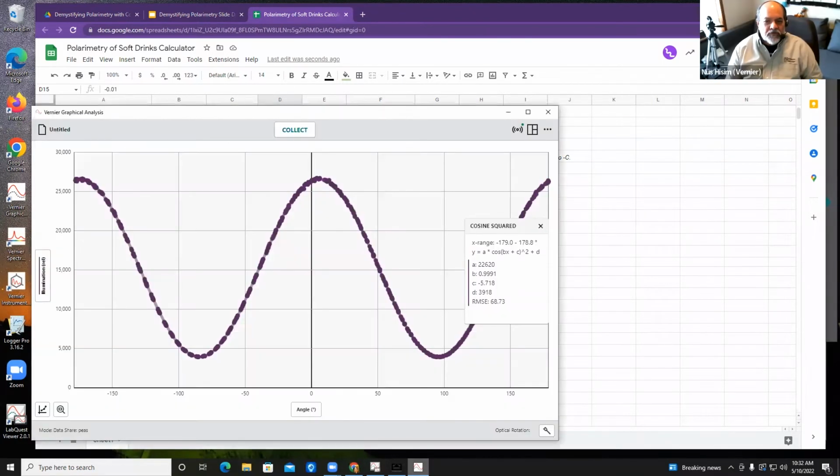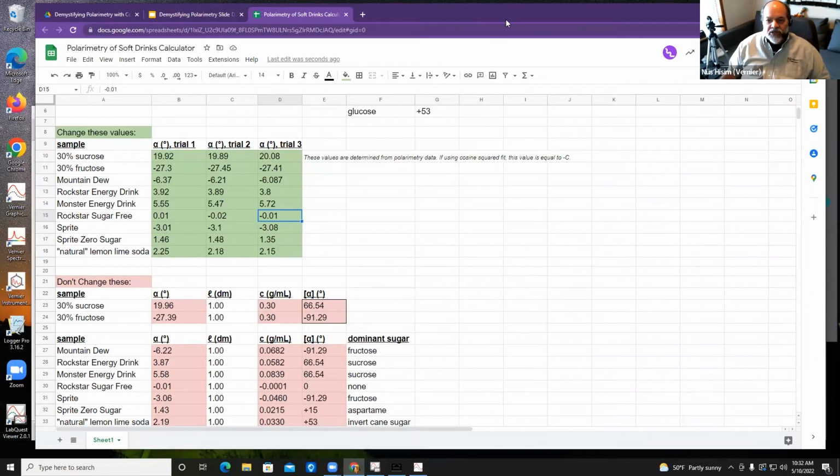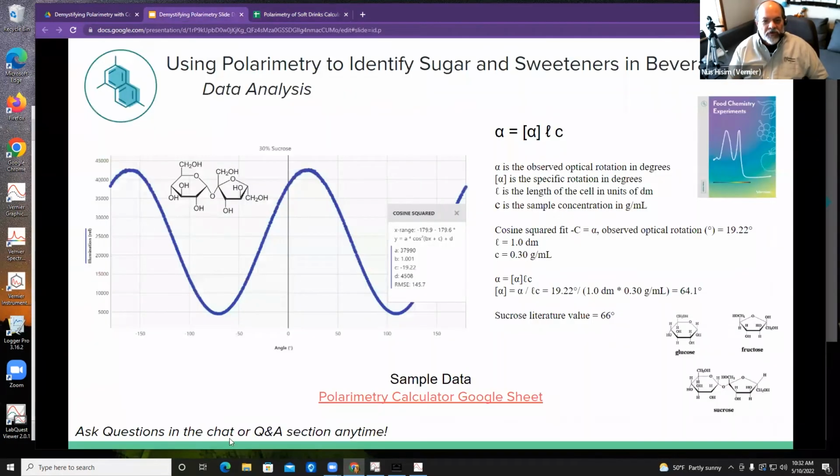I think what strikes me the most here is the fact that you can take that one sensor and share it. Here's a physical property that, particularly in organic chemistry, we might have waved our hands at, but there was no way to demonstrate it. You could use a hand polarimeter, but there wasn't any other real easy way. You just collected 6 sets of data in 10 minutes and shared it with the world. I think that's kind of neat. I would love to be able to do this in my classroom now.